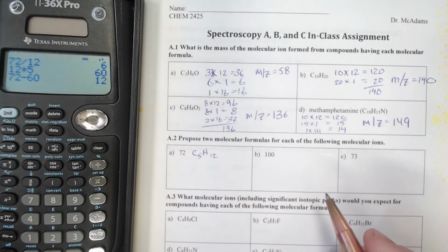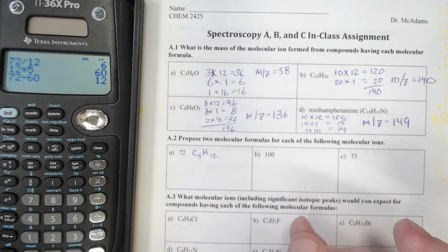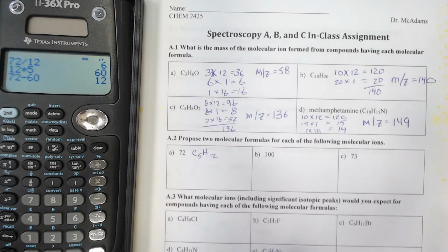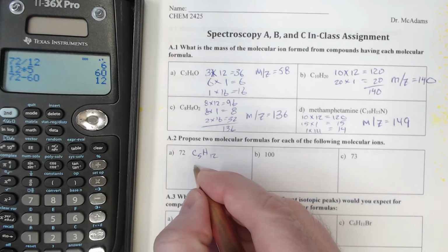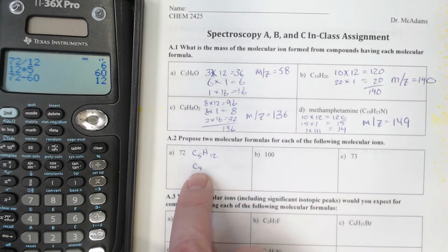Now, we're probably not going to be able to fit a heteroatom in there like nitrogen or oxygen. Nitrogen, since the mass is even, we'd have to have an even number of nitrogens, and oxygen has a mass of 16, so that wouldn't work. So let's go down to C4. 4 times 12 is 48.